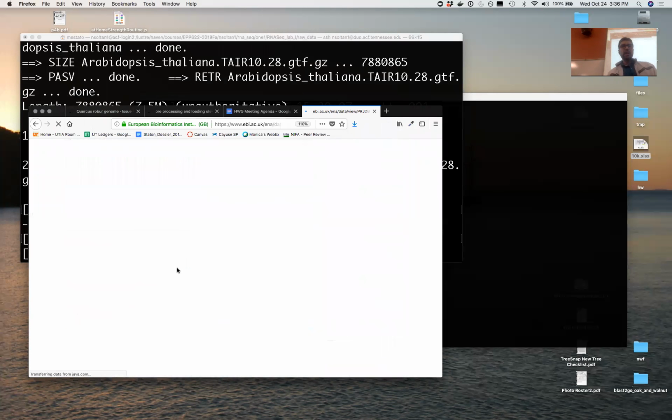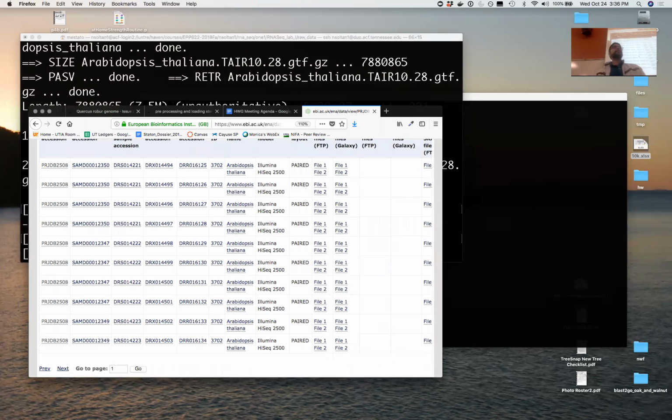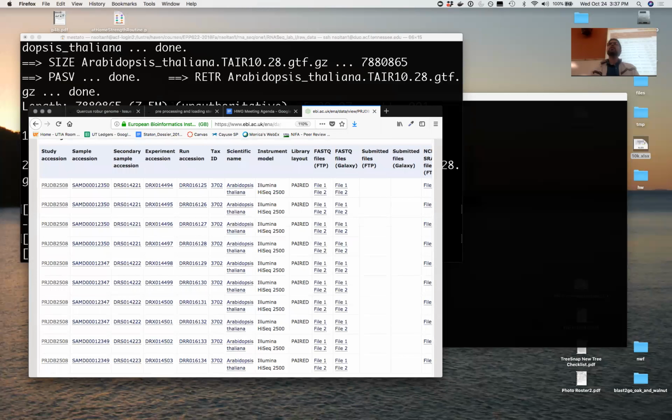These two links show you how the files are structured. The study we chose today has 16 paired-end reads for Arabidopsis thaliana under 4 different environments and with 4 different phenotypes. The reads you need to download are the FASTQ files via FTP. Since there are about 32 reads, I downloaded just 2 of them. We are doing the analysis today based on one of these reads, and at the end I will show you how to do a loop command when you want to do the mapping for all of the paired-end reads for this study.